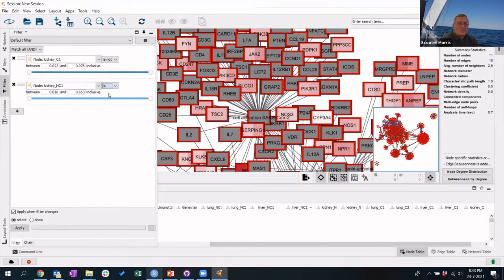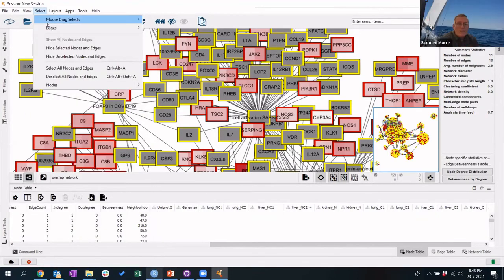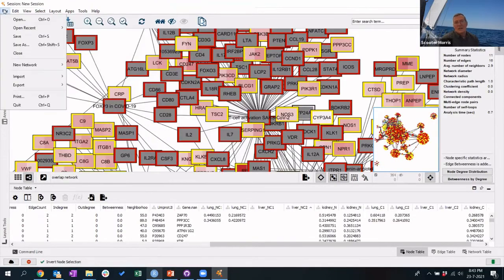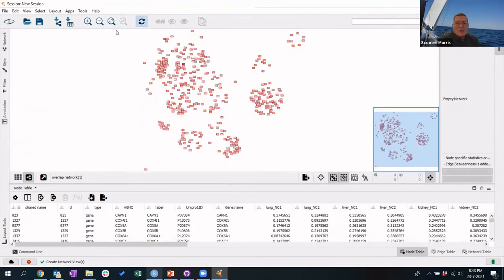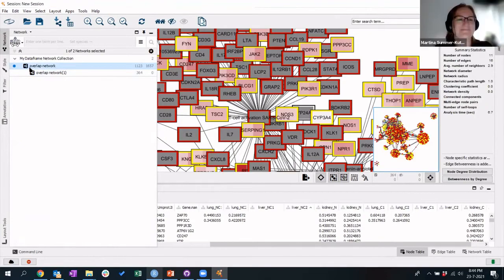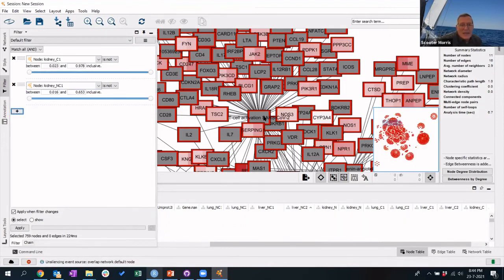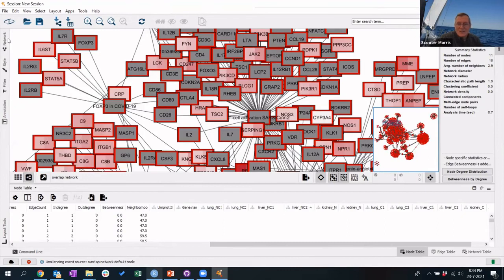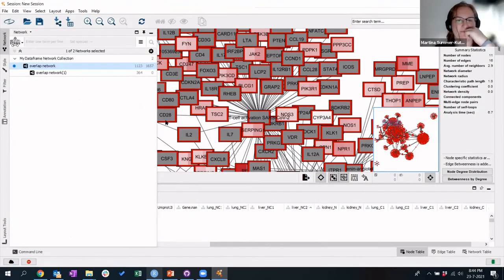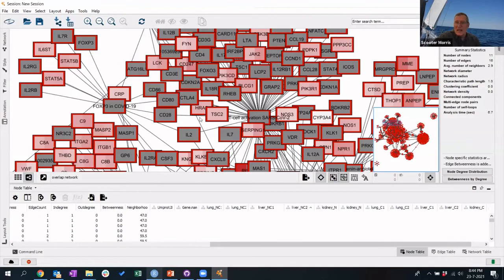Exactly. So you need to focus only on one pathway. Probably you'll have to focus on only one pathway, right? Think about it for a second. You're probably going to only be able to do 10 nodes, 15 nodes with a heat map on it. And how many nodes are in this network? Too many, 1,023. Right. So there's 1,000 nodes. So you have to cut this down by roughly 2 orders of magnitude before it's going to be something that you can look at in a paper.